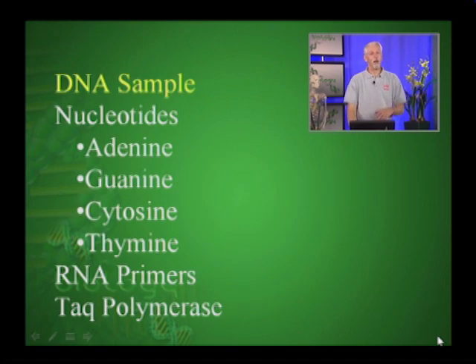But before we get to that, in this PCR process the PCR cycler is basically like an oven. It will heat and cool. In one of the tiny vials that we utilized in our last module, you'd put some sample of DNA, and that DNA sample would have the gene of interest to us. One of the good things about PCR is that we don't need to know exactly where those genes are, but we do need to know some of the sequences on either side of our gene, and we'll see that in a couple of seconds.